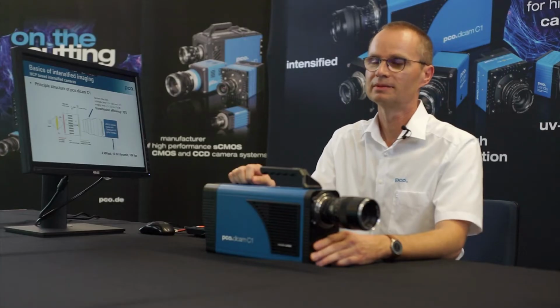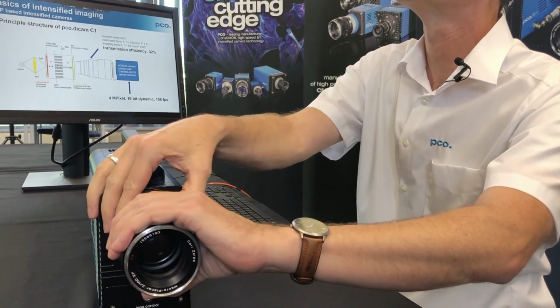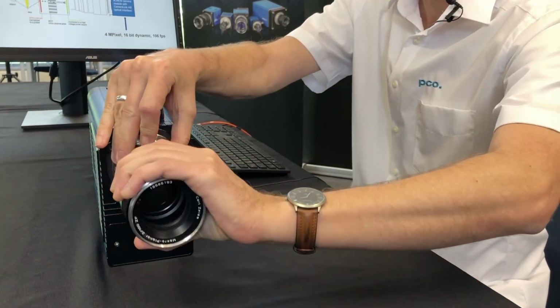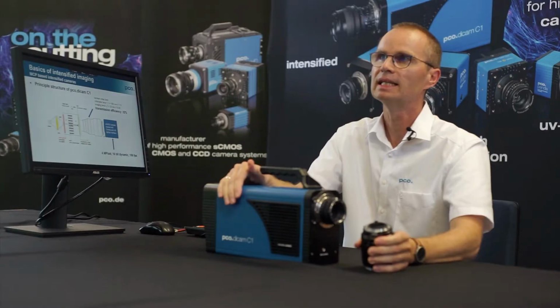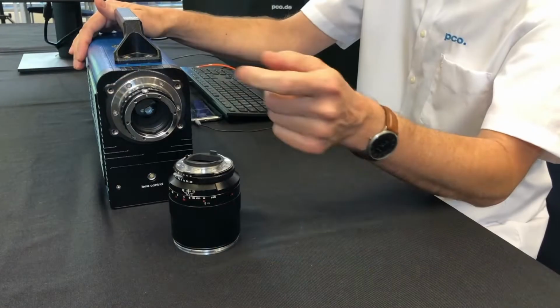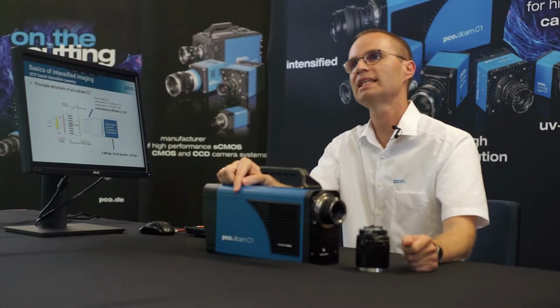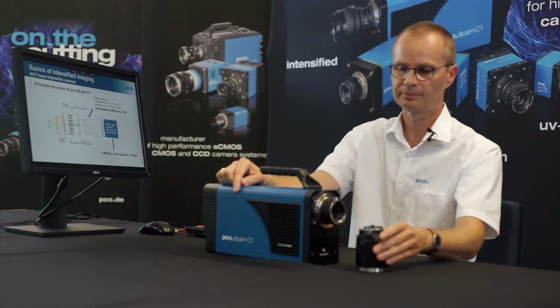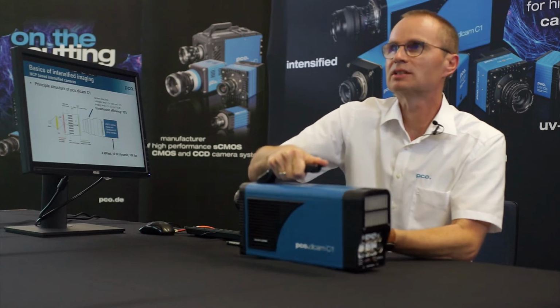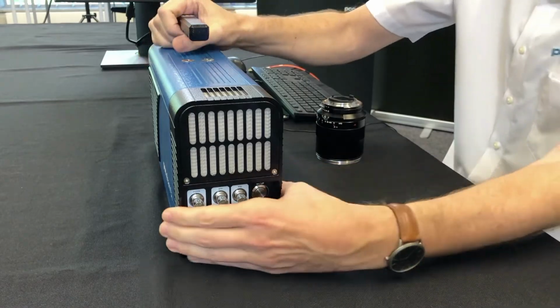Here we are. The front end hosts the optical input. You can mount almost any manual lens as well as many motorized lenses which can be remotely controlled. The input lens focuses the image onto the photocathode of the image intensifier tube. And from here, the intensification process starts as described before. Our user interface to the CMOS camera, where we can retrieve the images, is here at the back end.